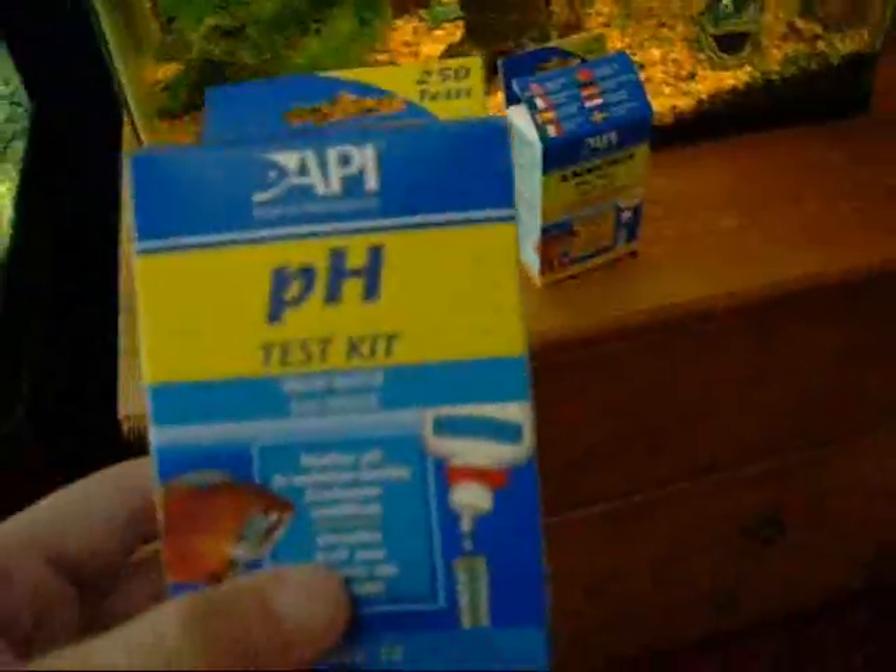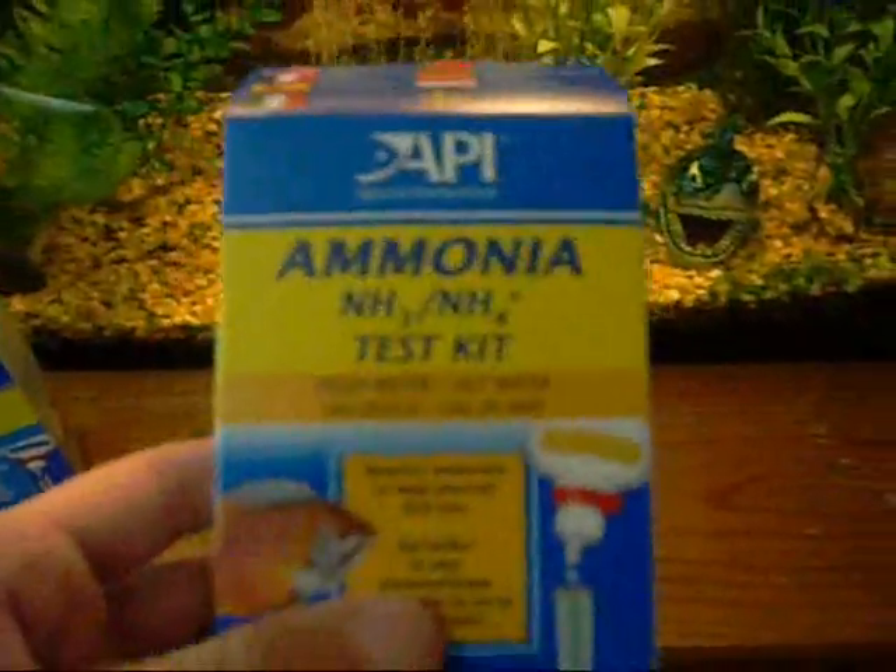Hey guys, GatorsFishChannel here. Today we're going to be testing your pH and ammonia water levels.